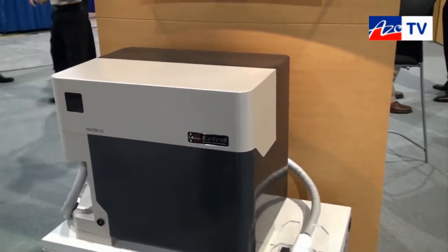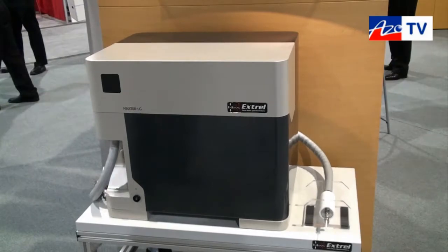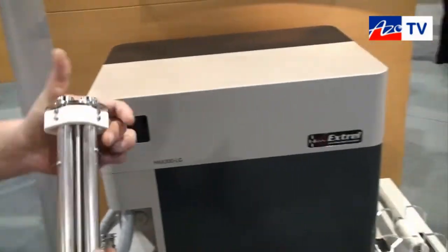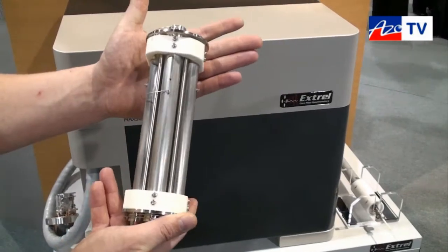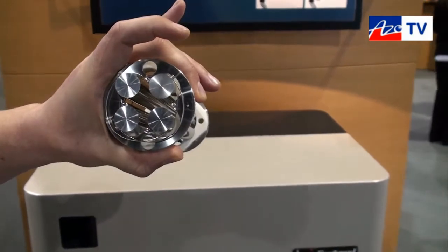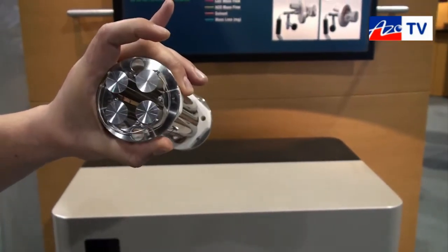We also have our three-quarter inch quadruple technology that we use. Here you see the three-quarter inch quadruple, and this allows for higher sensitivity and higher transmission through the quadruple, increasing throughput.